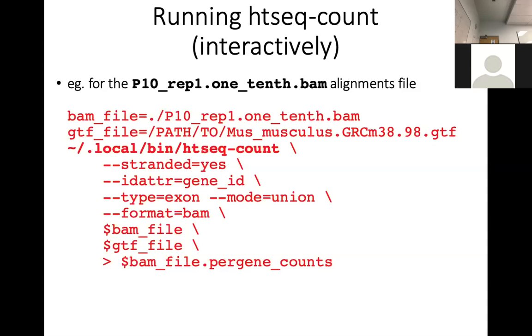When you do variable equal, you're creating the content for a variable name. And then when you do $name, you're replacing that name with the content that is associated to it.